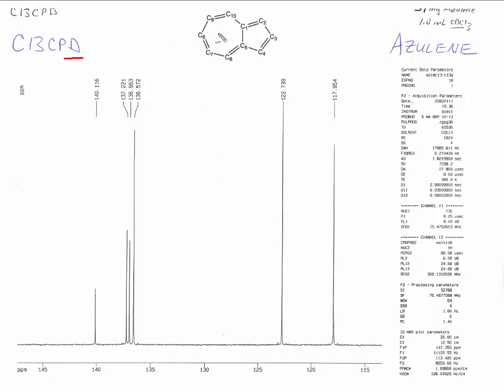And that's true. It's the same 5 that we looked at before, plus now we have C1 and C5 would be associated with one of these signals. So this is going to be a little bit harder. We don't have any splittings to look at here.